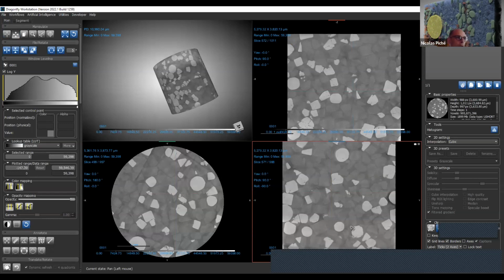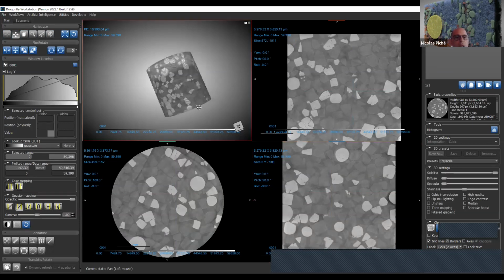In the laboratory, they have defined a zero position, and everything jumps into place when you load it, when you're doing multiple sagittal, coronal, or oblique acquisitions. These buttons change only the camera position or distance, that kind of thing.